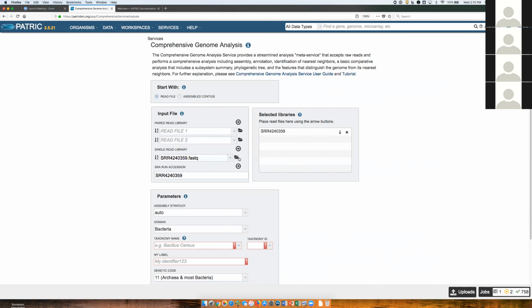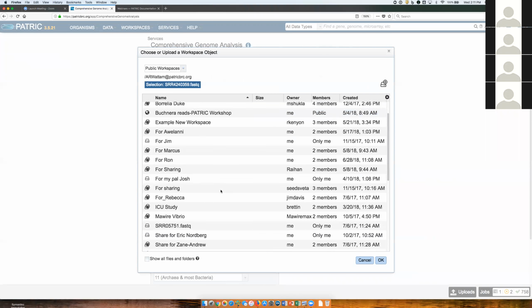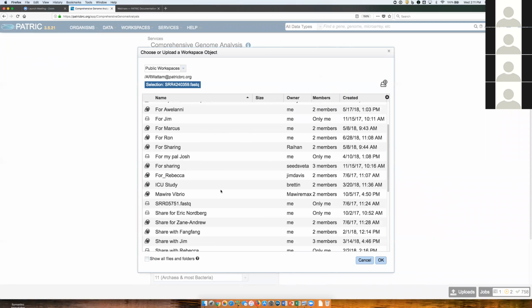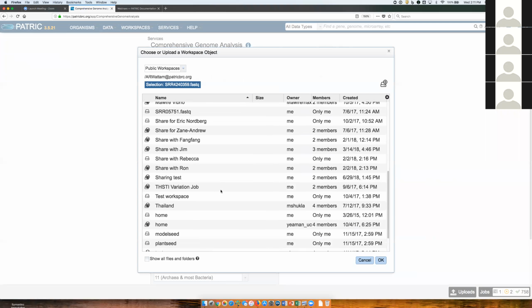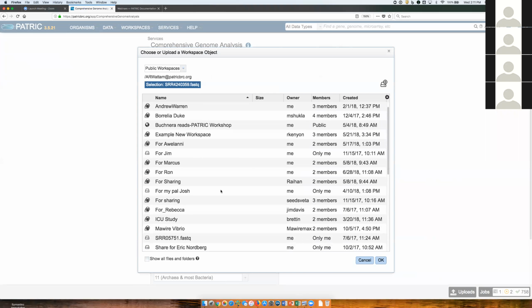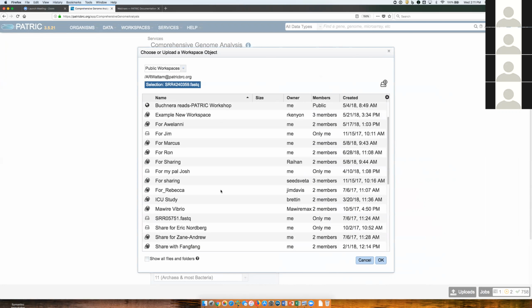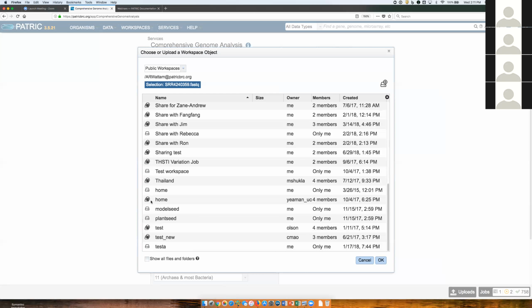One more thing, because we've had this question. This is the easiest way for you to do it right now, but let me show you another place that these reads are. First, I want to cancel this and go back. I want to go back to my parent folder. Oh, sorry. All right. And down here in the public workspace, we should have a folder that everybody can see. Keith was having trouble seeing it from there. But generally there's a thing called PATRIC Workshop. I may have to go into Home to see that, the global home.